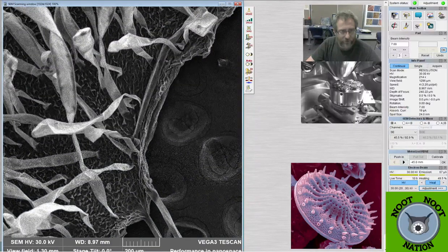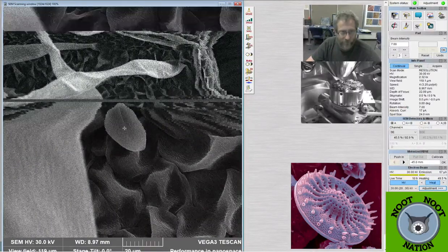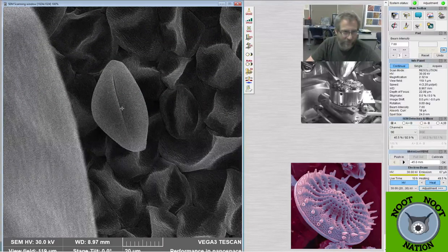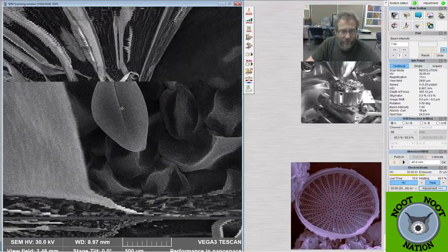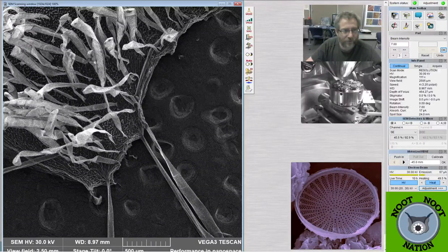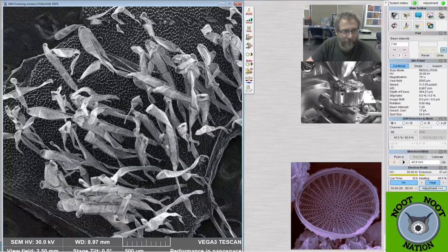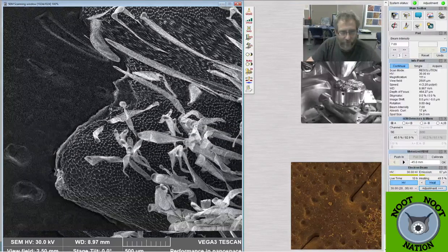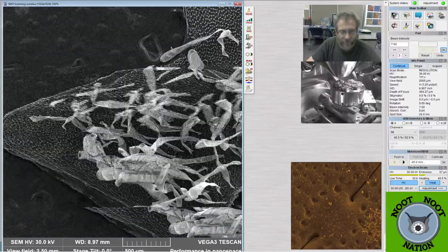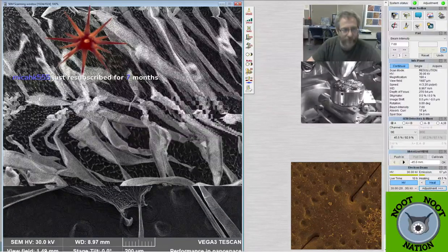Just gonna check real quick unless I find something else that looks different. Yeah, these all look pretty similar. So, slightly different in the sense that the other ones were a little bit more football shaped or rugby shaped. These ones, for this particular violet, are a little bit more egg shaped, I guess.